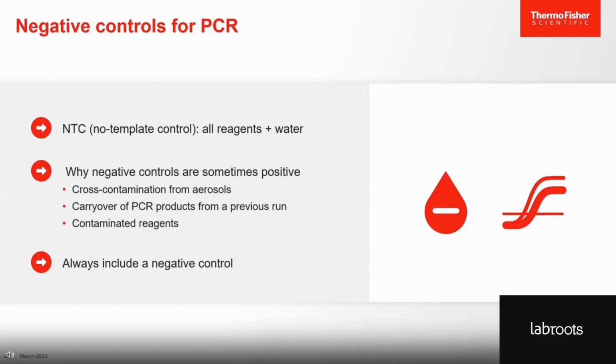Well, some cross-contamination can happen from other samples present. For example, a DNA template may be introduced because some of the reagents like water or reaction buffer used are contaminated with gDNA or PCR product. So, just to know when this might be the case, it's good to always include a negative control. Otherwise, one cannot really trust the positive controls.